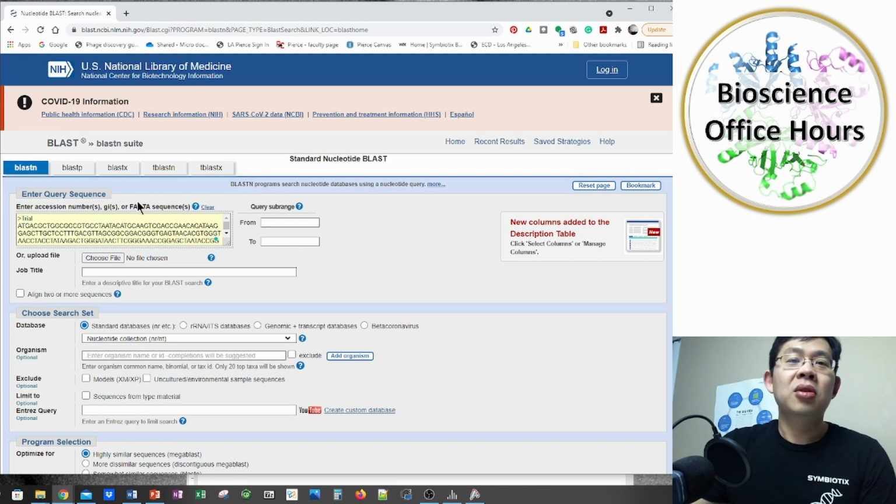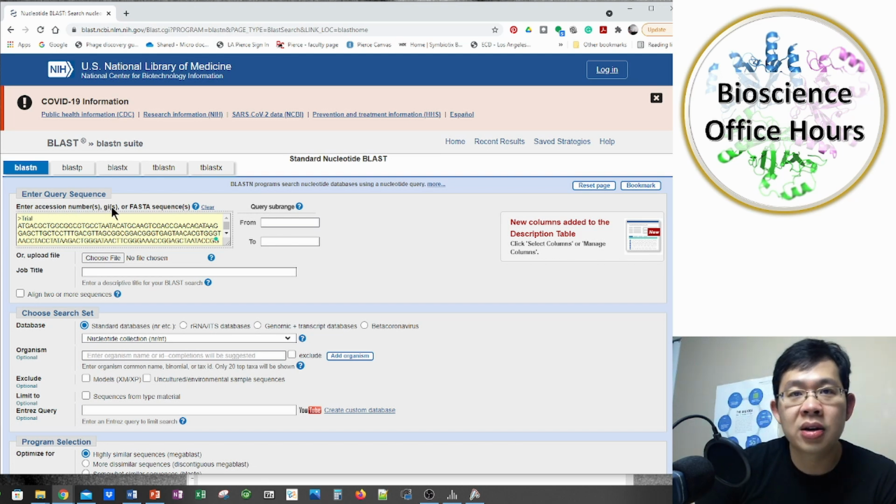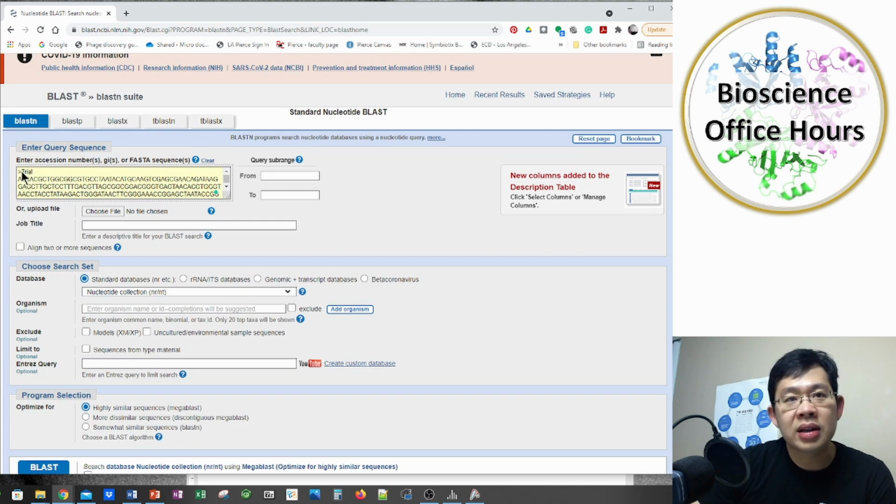Okay, so you can do several other things. You can upload a file if you want, or you can use the so-called accession number, which I'm not gonna talk about in here, or GI and so on and so forth. But here let's just do a very basic sequence analysis.